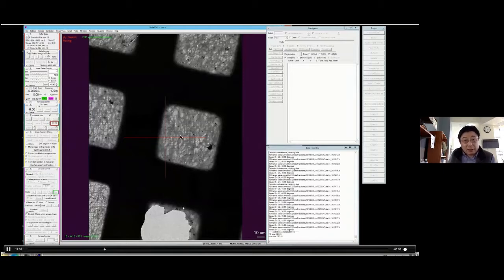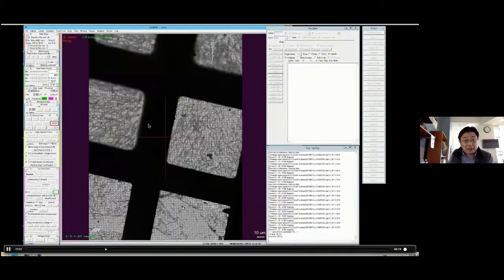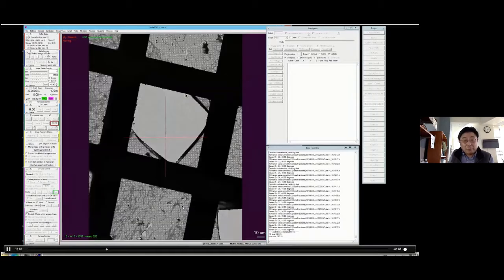So then we can get very quickly to the things we want. And one of the nice things, back to one of the questions I would ask, is that we can do overnight data acquisition, because tilt series take a lot of time. And typically the night time is the best time because the microscope seems more stable. And so I think we're almost there. This is about 2 more minutes.